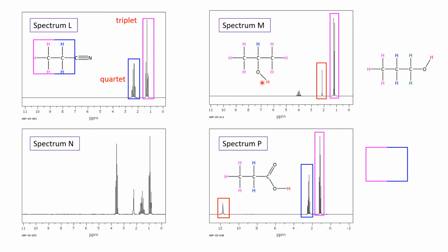We have the singlet associated with the alcoholic H, and then we have a big mess here that's going to be associated with the blue hydrogen there, split into, one would imagine, at least 7, depending upon what this H does, but we'll assume the H does nothing. So split into 7 because of its adjacency to the 6 pink ones. And you can see 1, 2, 3, you can vaguely see 7 peaks there. So fairly sure that that's the blue one. Leaving, of course, N with its 4 peaks to be associated with propan-1-ol, which of course has the 4 expected types of hydrogen.